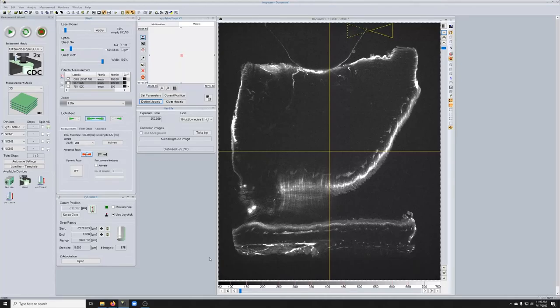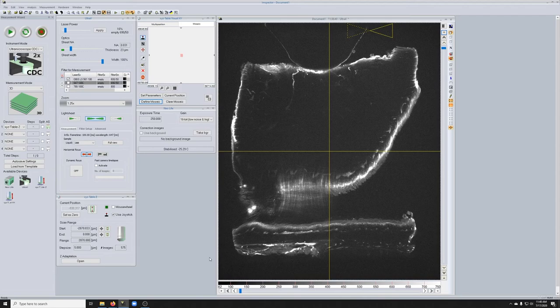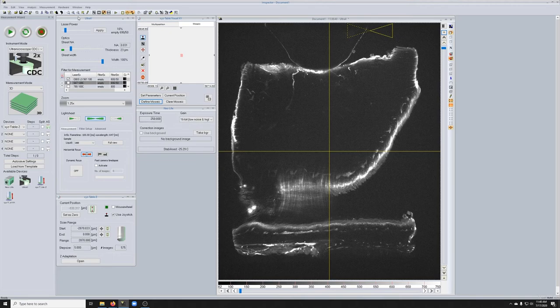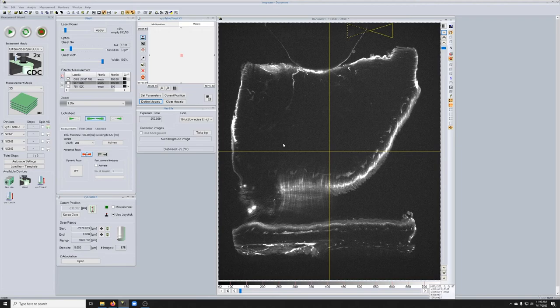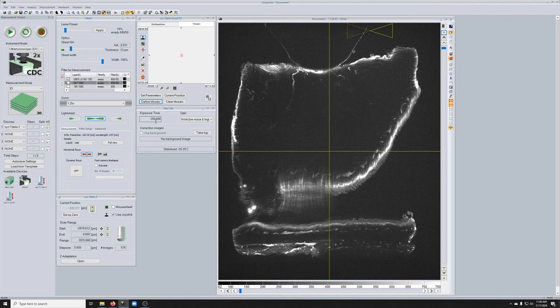Before we take a Z-stack in a single channel, one last thing that we need to determine is the appropriate exposure time and laser power. What we recommend is that when you're looking at the sample, you keep the laser power at 10% and modify the quality of the image by adjusting the exposure time. The reason is to minimize bleaching.